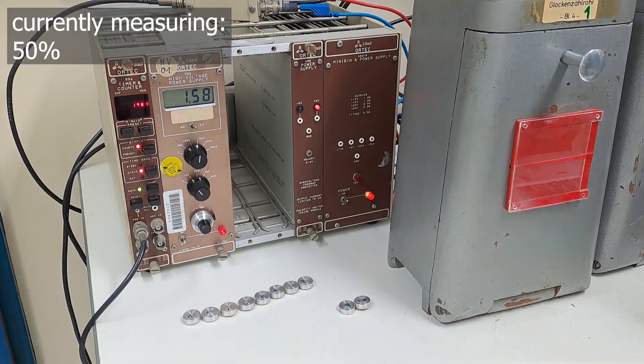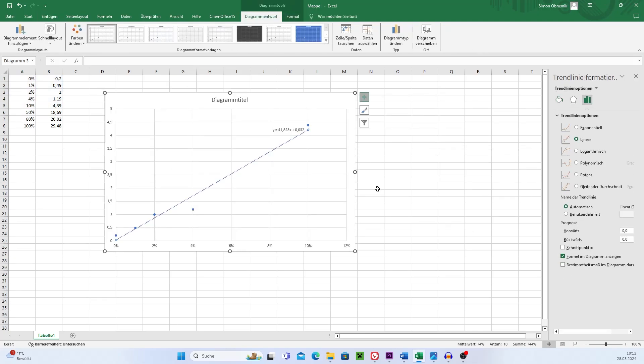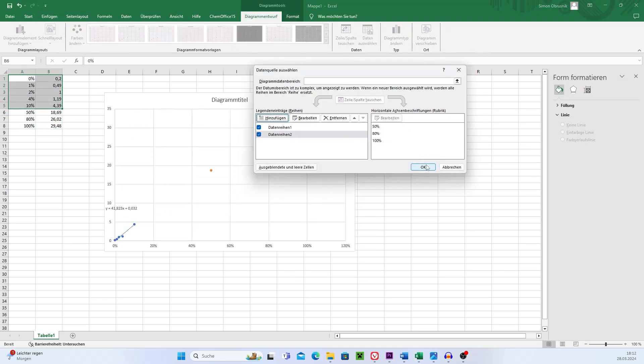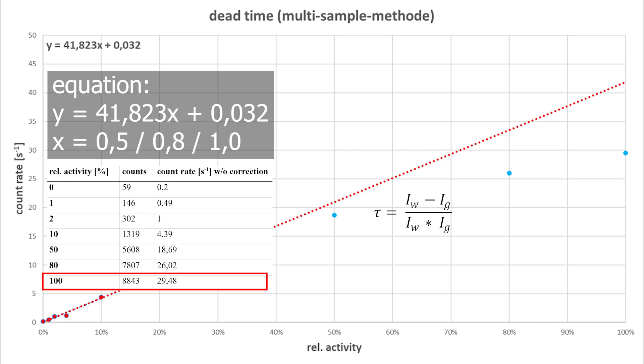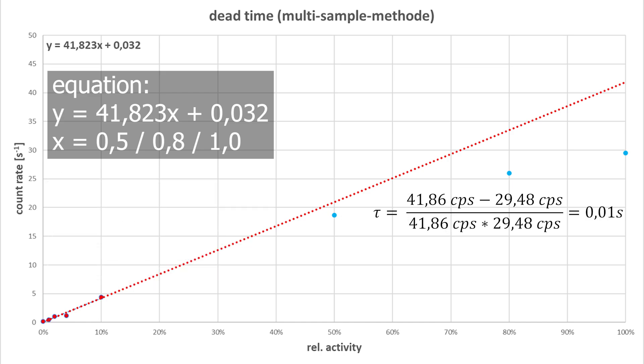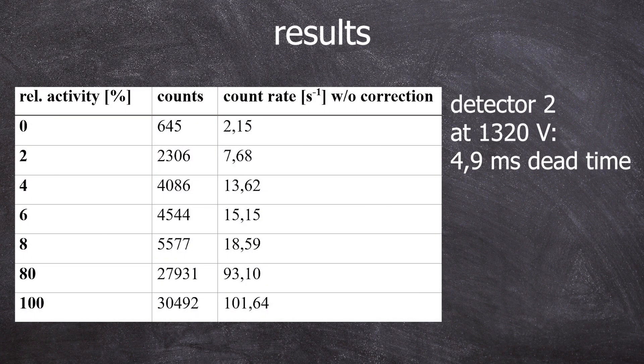How do we analyze these results? Here are the raw data divided by the measuring time of 300 seconds. Now it's time to calculate the dead time. For x we plug in 0.5, 0.8, or 1.0. Using 1.0, I get 41.86 counts per second which I should have measured, but I only measured 29.48 counts per second. Plugging this into our equation gives a dead time of about 0.01 seconds — 10 milliseconds — which is much better than the previous end window tube. I also did the same for detector 2 and got a dead time of 4.9 milliseconds.